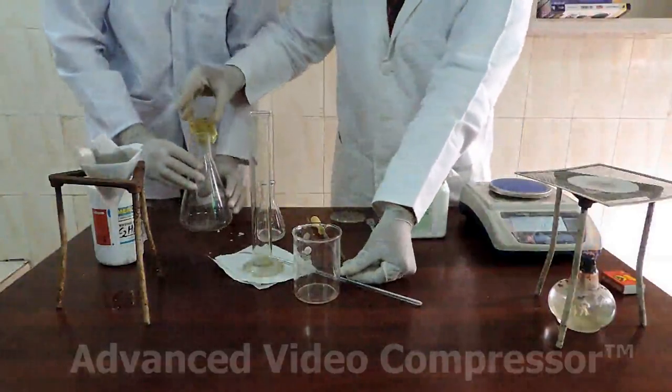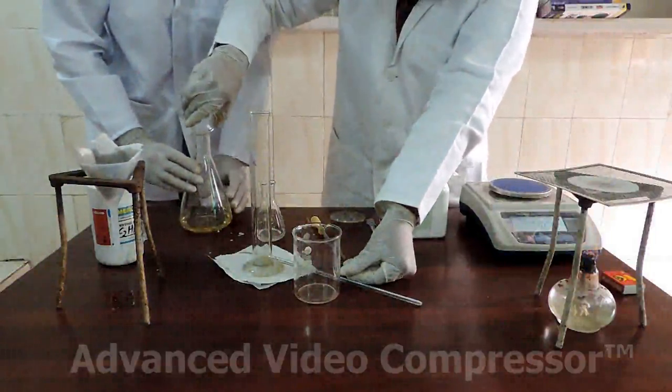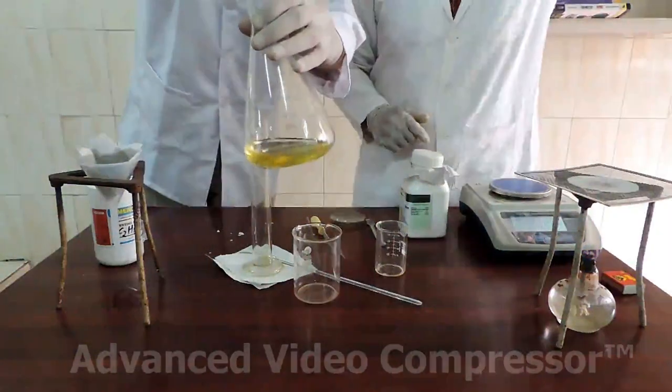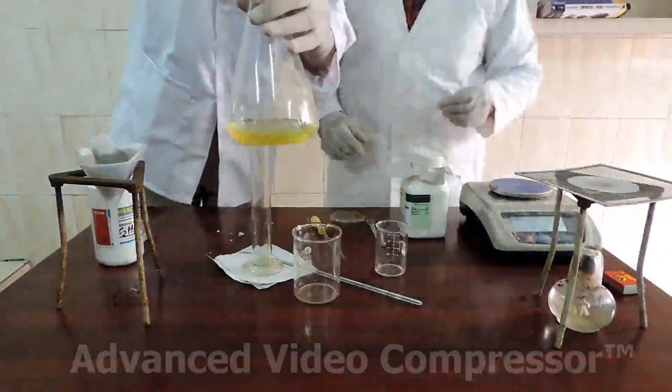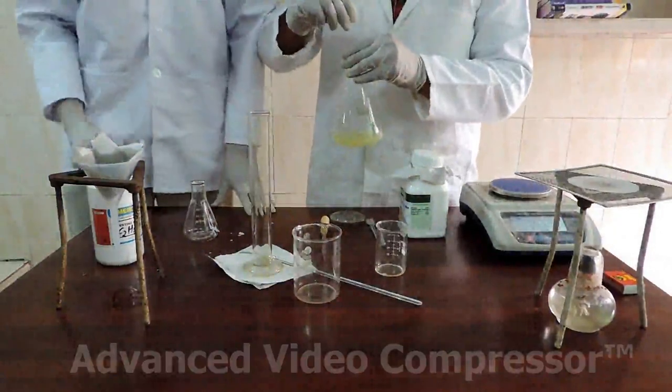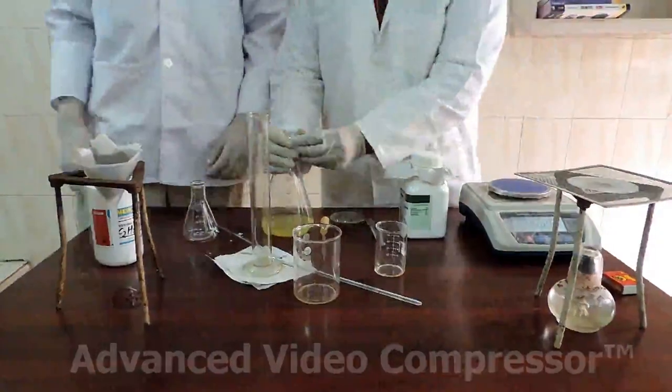We transfer the hot oil to the conical flask. Add the mixture into the hot oil. Mix it and cover the flask with aluminum foil.